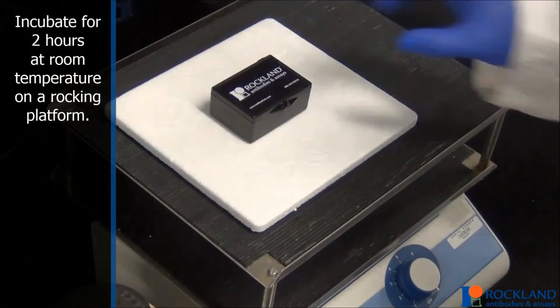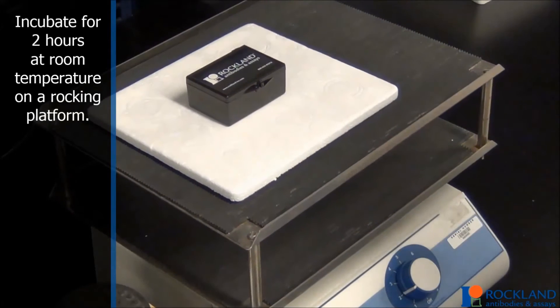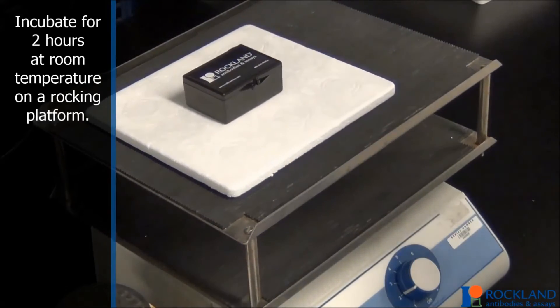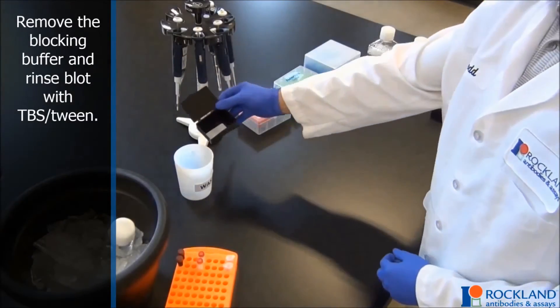Place the membrane into the blocking buffer, enough to cover the membrane, and incubate for 2 hours at room temperature on a rocking platform. Remove the blocking buffer and rinse blot with TBS-Tween.